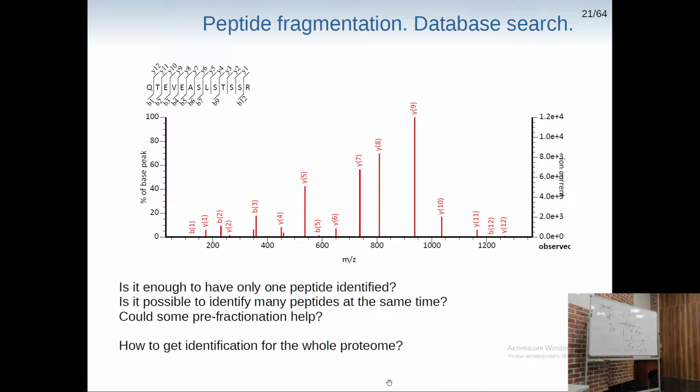So those rules are more or less just common sense rules. But if you have a lot of proteins, if we just work with a proteome and we have such an identification, be it even this signature peptide, we can say that we identify this protein in any way.